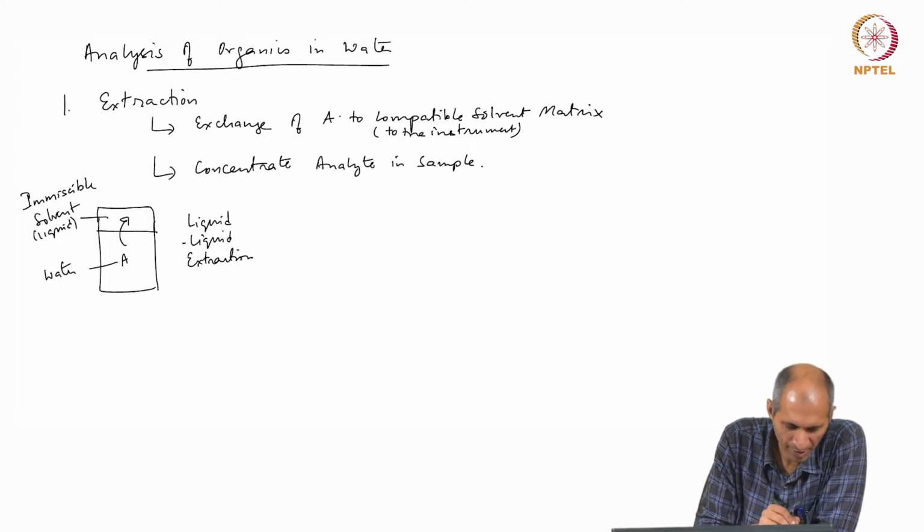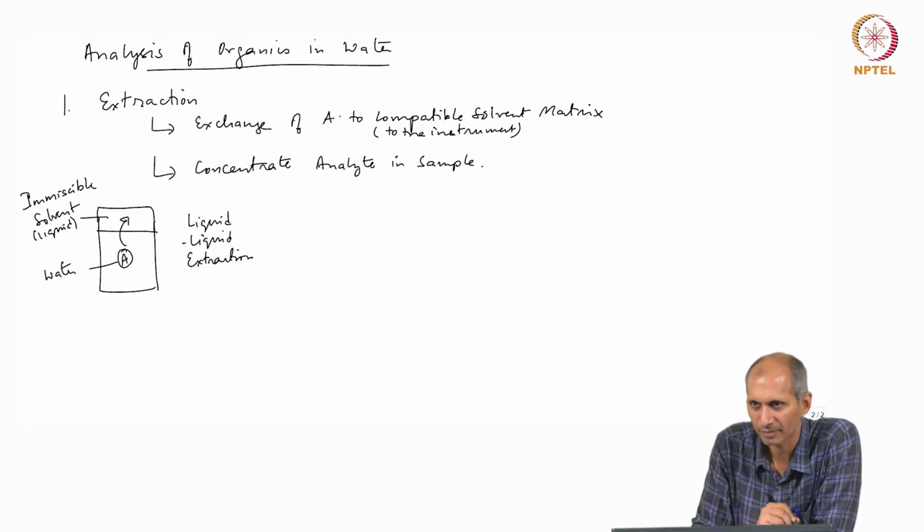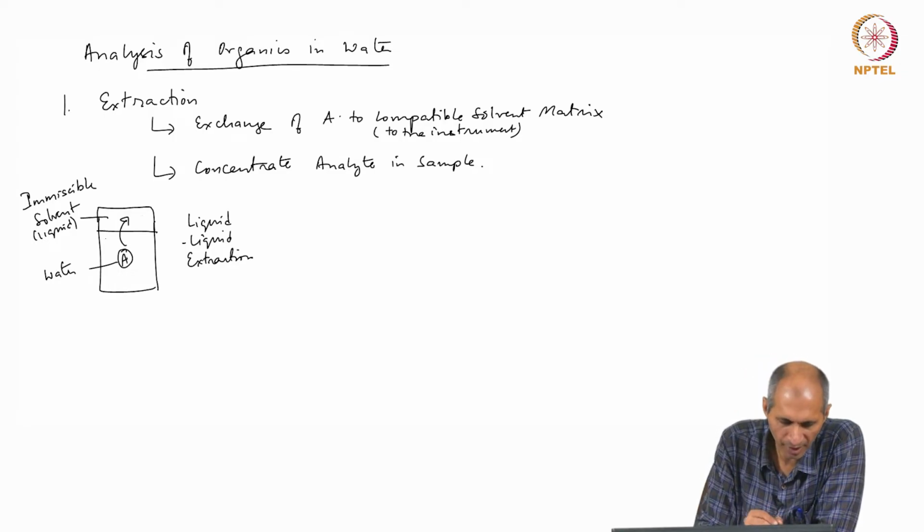So, typically an immiscible solvent which has a greater solubility of A in it. Some organic solvent that can hold A in a larger quantity.